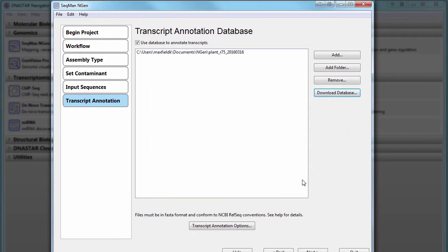During assembly, the software will compare the assembled contigs to known genes from RefSeq, located in the transcript annotation database, and then cluster contigs into larger, more complete transcripts.